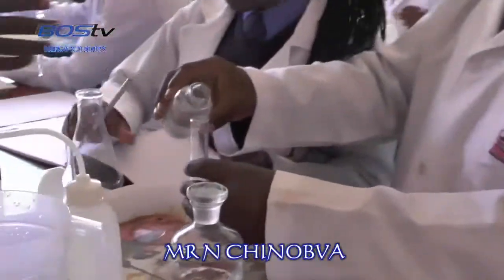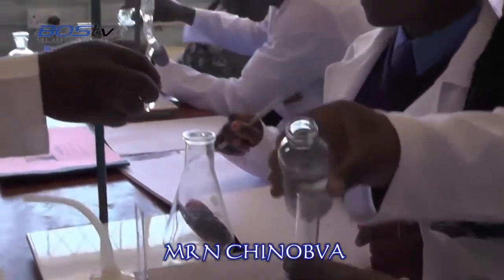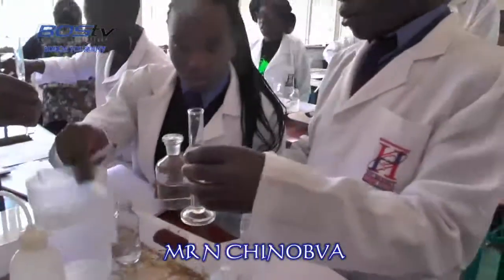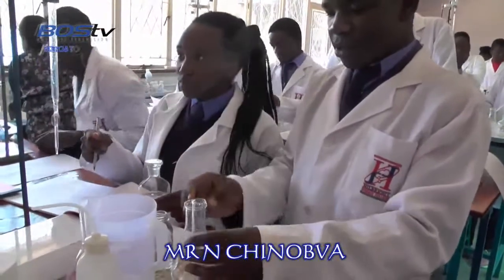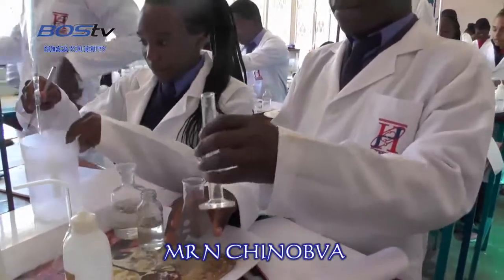Make sure that when you pour your solution into your burette, you allow some to run out first before you begin the actual titration. Ensure that your burette tap is initially closed.